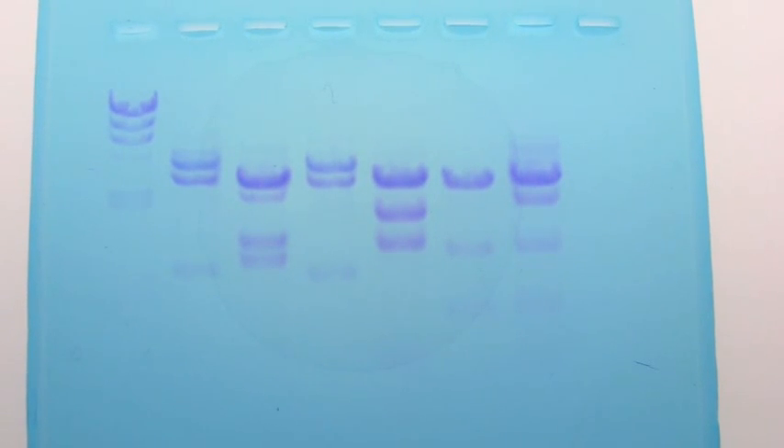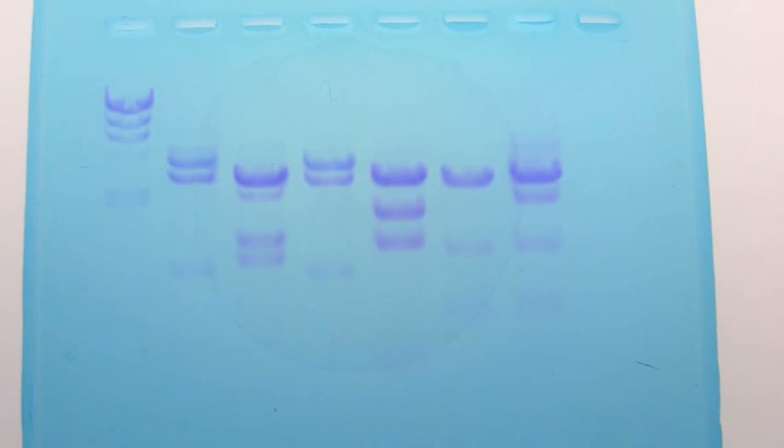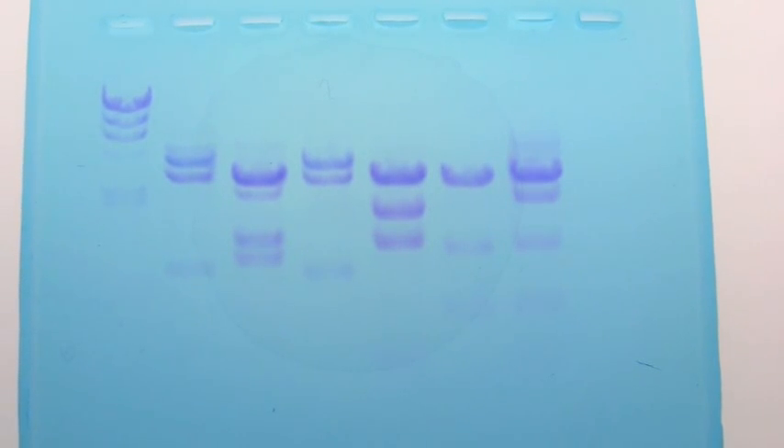Here, you can see that suspect number 2, which is in lane 4, matches the criminal DNA. Case solved.